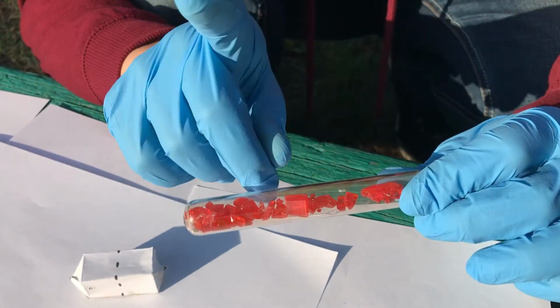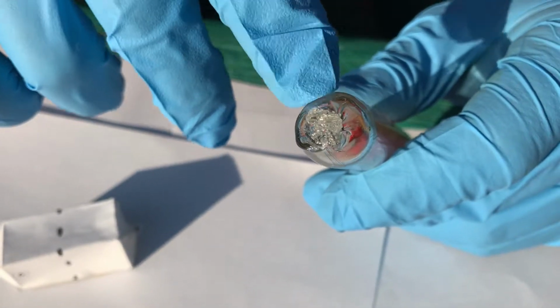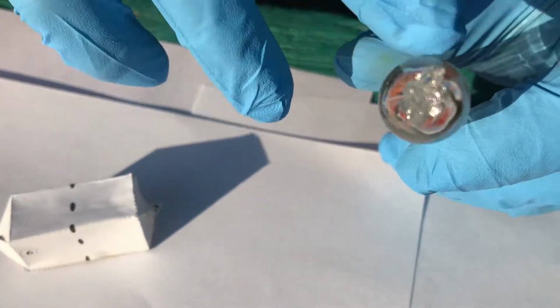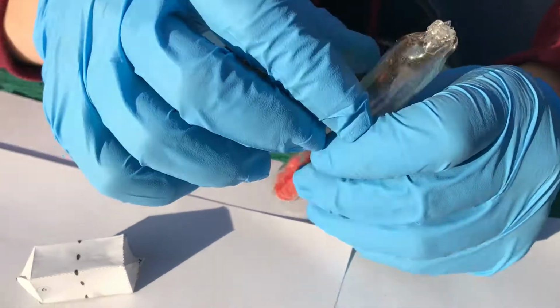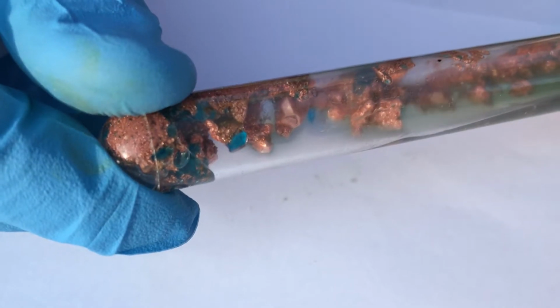I would like to mention these crystals are especially dangerous for the skin because potassium dichromate is carcinogenic. This is why I have stored them in an ampule made by myself. I created it from a test tube. In this sealed test tube, I have stored copper metal crystals.